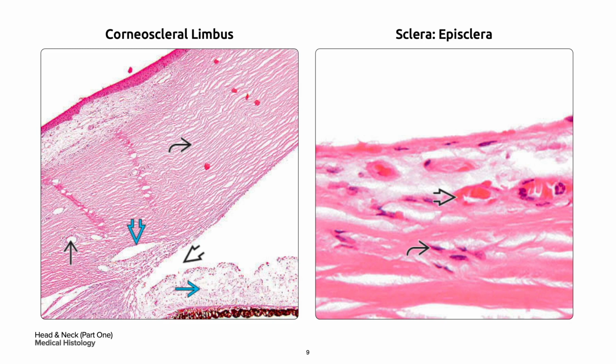As the corneal stroma blends into the sclera, delicate blood vessels that are absent in the corneal stroma can be identified, as pointed out in the black single arrow. On your right is the episclera, which composes the outermost layer of the sclera. It contains more numerous blood vessels in the bold black arrow admixed with collagen and fibroblasts in the curved black arrow.